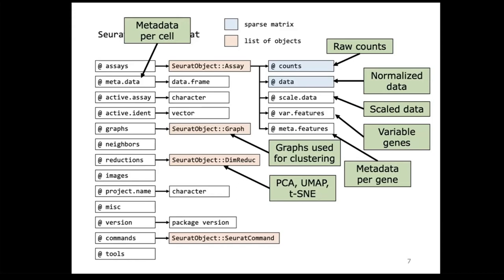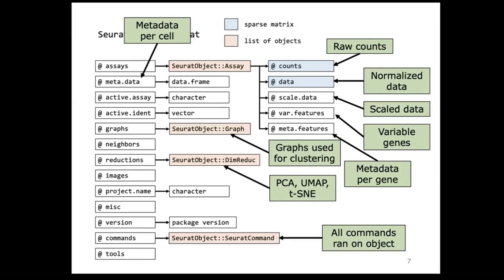One slot that is not very frequently used but I find very convenient is the commands slot. In the commands slot, you can store all the commands that have been run to generate the Seurat object you're looking at. So if a colleague gives you a Seurat object without a script, you can look in the commands slot to find the history of all commands used to generate that particular object — it can be very convenient to figure out the history of a Seurat object.